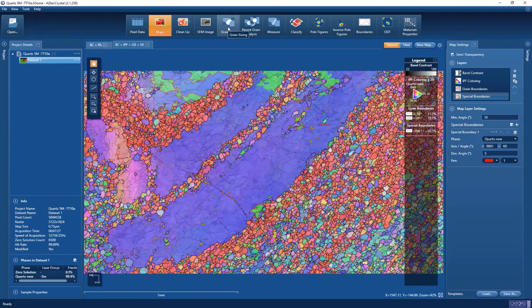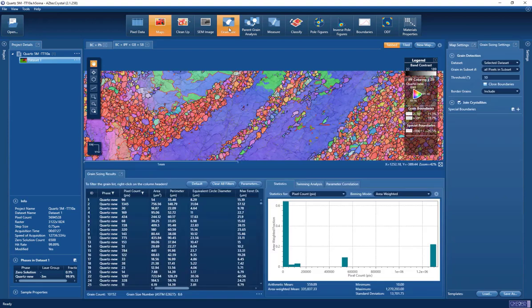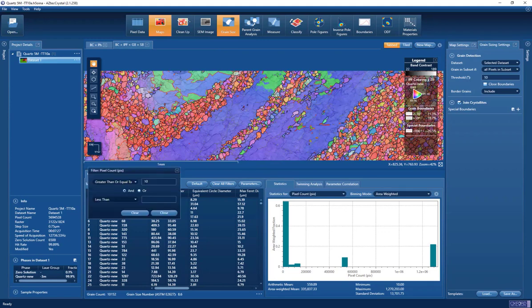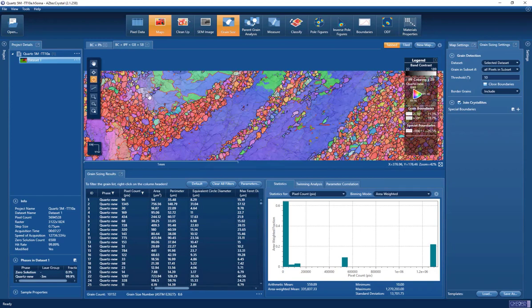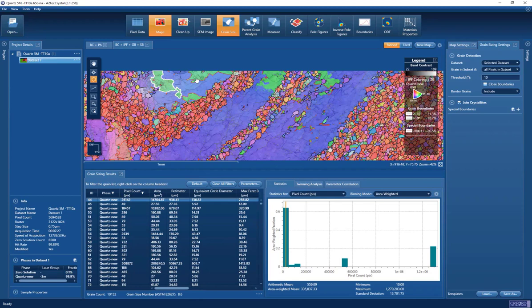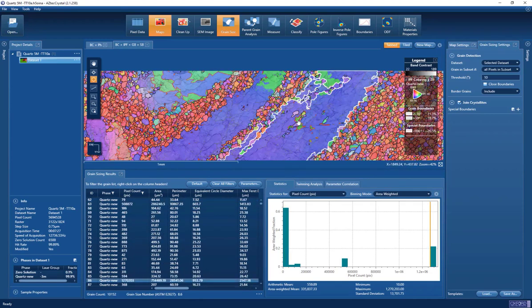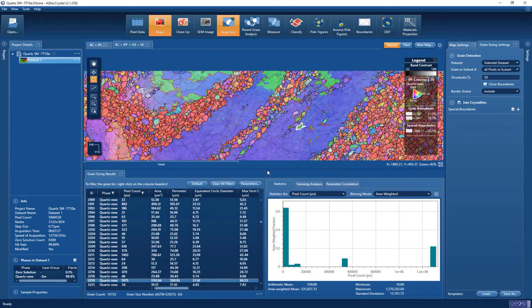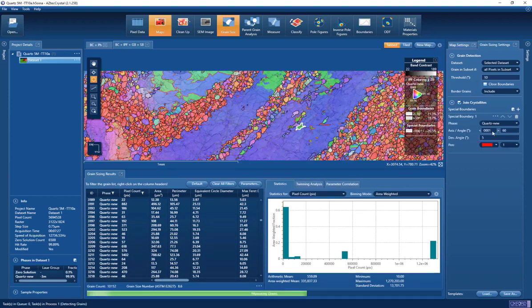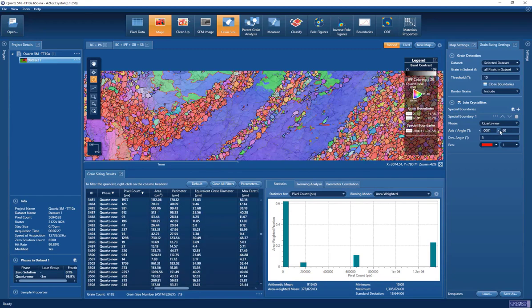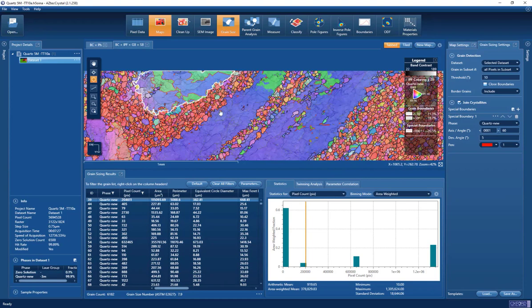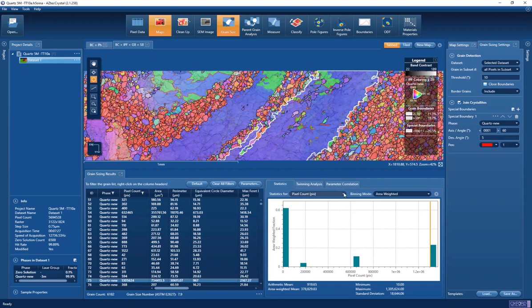One of the first things we want to do with EBSD data is measure grain size. We go to our grain size viewing mode, which pre-calculates grain size when we load the data and recalculates after cleaning. We can filter the grain list by phase and exclude grains below a certain size — the default is below 10 pixels, conforming to an ISO standard. However, twinned regions inside large grains are being picked out as individual grains whereas they are in fact twin domains that should be measured as part of the overall grain. So we specify that boundary relationship and now it ignores those twins.